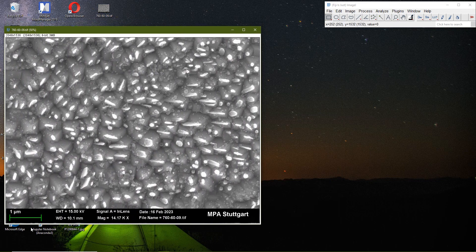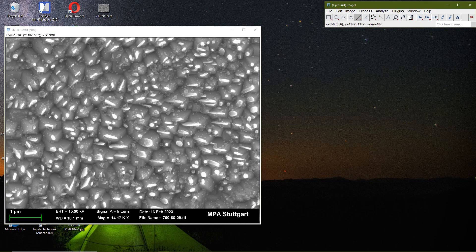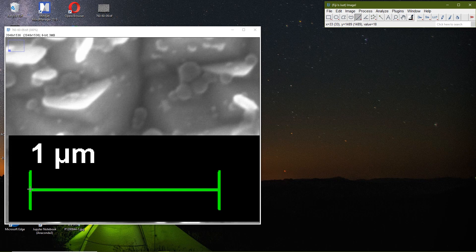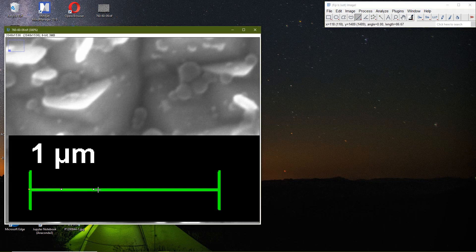The first thing I want to do is select the scalar line tool and tell it the size of this image. I'll click on this line, zoom in by pressing Shift and scrolling with the mouse button, and keep pressing Shift so the line stays straight. I draw it across here so this line is one micrometer long, which means it is 1000 nanometers.